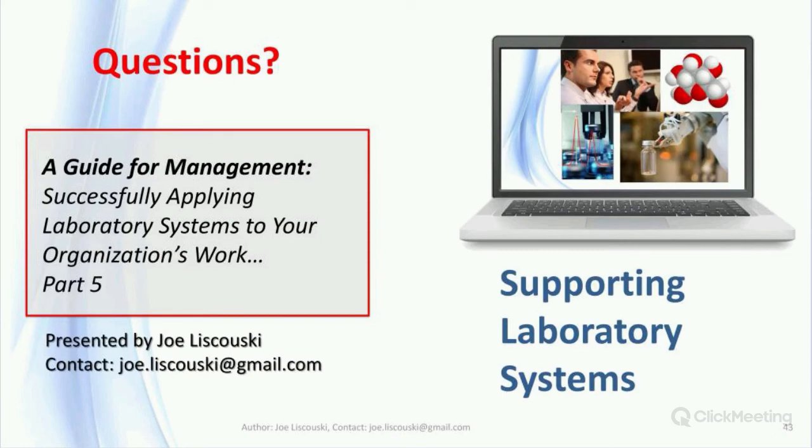Lab personnel need to understand what technologies are available to them, how they can be integrated into their workflows, and how they connect to other systems. And that's the education part. Planning takes that understanding and how things are going to work in both the short term and long term, plus the ability to deal with change, both technologically and handling change management for people as well.